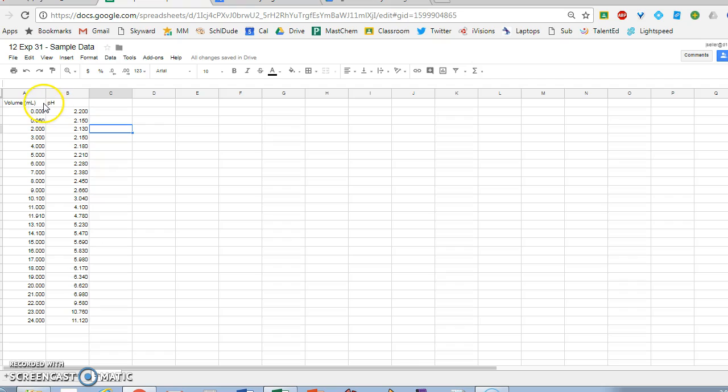I'd like to show you as briefly as I can how to do that in Google Sheets. What you're going to need is to get your CSV (comma-separated-value file) from graphical analysis. The easiest way to do that is to just export the CSV up in the file menu.